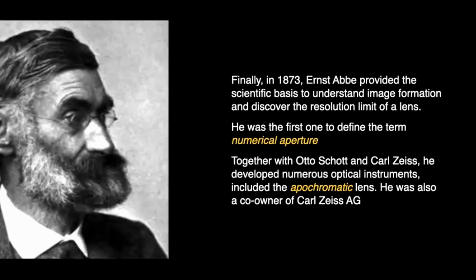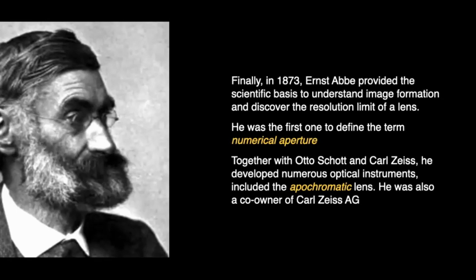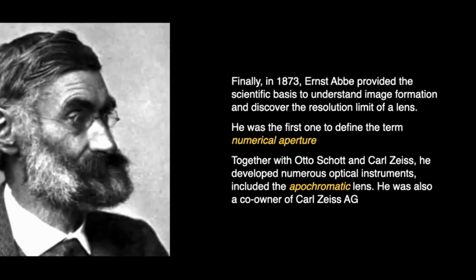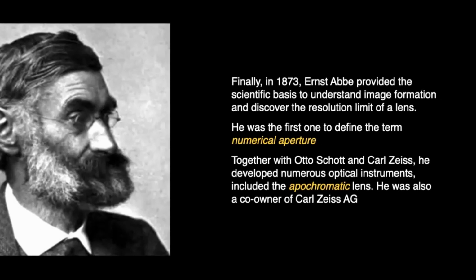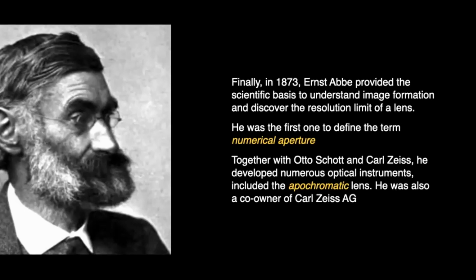including the apochromatic lens, of which you will hear more. He used for the first time the term numerical aperture, he defined resolution, and all these things that you will learn about in this lesson, if I manage to convey the message. And by the way, Ernst Abbe, I'm the head of the ABBE platform, and this is not a coincidence. I gave the name to the microscopy department of the Champalimaud in tribute to the great scientist. All our lenses, all the objectives, all the microscopes, all the telescopes, your eyeglasses, phones, and everything that uses lenses are designed according to the creations of Abbe.